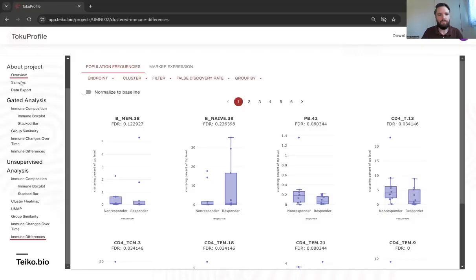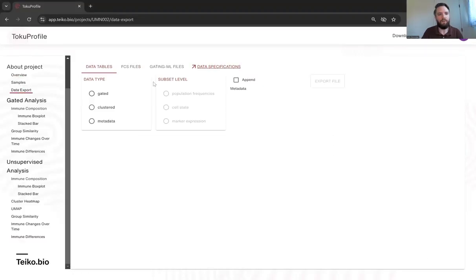If I purchase the base tier, is it possible for me to do the analysis provided in core myself? Yes, like I was mentioning, let me just share again. The base level tier includes essentially the raw data plus, so everything in the data export tab is really the most useful for, these are the key deliverables for a base level project.